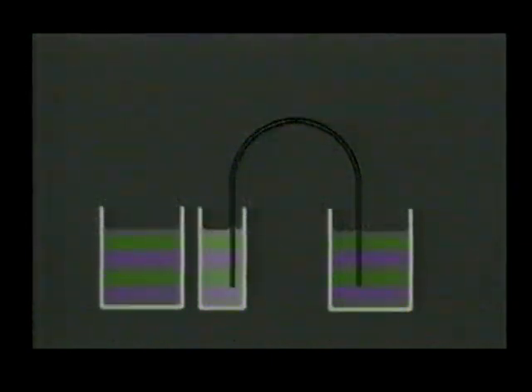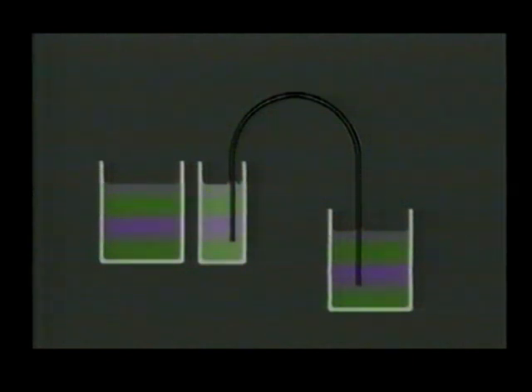Electrokinetic injection involves the direct electromigration of the sample into the capillary following application of a transient high voltage. This technique can be very selective, since the amount of each analyte injected is dependent upon its mobility and the electroosmotic flow.